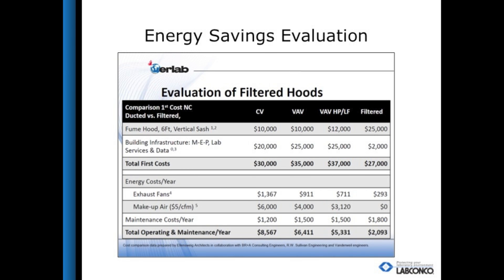To illustrate the energy savings the Echo could provide, this chart shows a comparison between a constant volume fume hood, a variable air volume fume hood, a variable air volume with high performance fume hood, and a filtered fume hood. Both the first costs as well as the operating and maintenance costs are much lower with the filtered fume hood. This makes sense because the filtered fume hood does not require ductwork or installation through the walls or on the roof, and does not require makeup air. The energy savings is substantial since the air is just recirculating through the room and not being exhausted outside, benefiting many future projects.